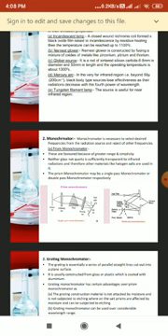These mirrors can be prepared from various materials like metals or glass coated with aluminum. The main advantage of these materials is that they have no chromatic aberration and are sturdy. Besides concave mirrors, plane reflecting mirrors are also used.